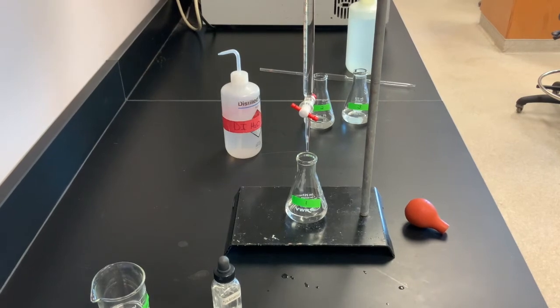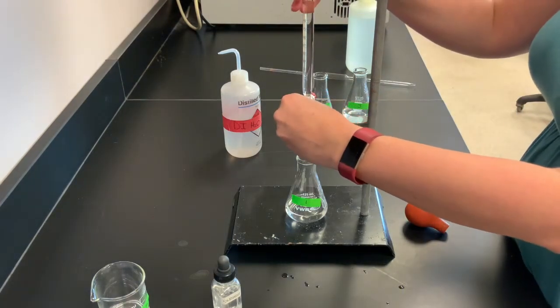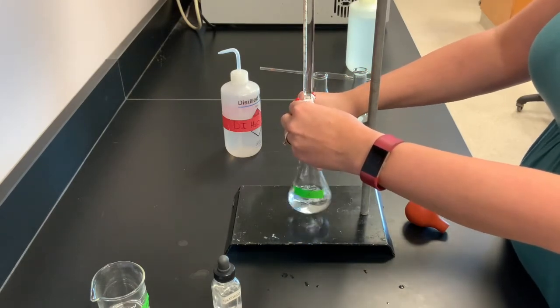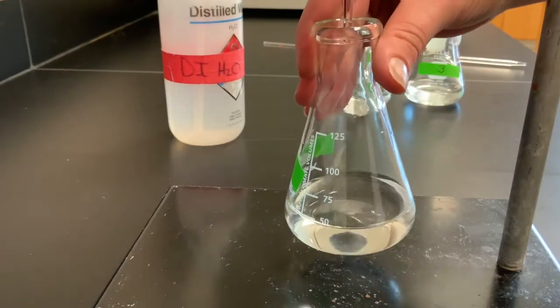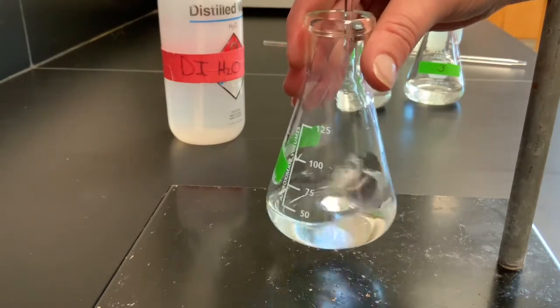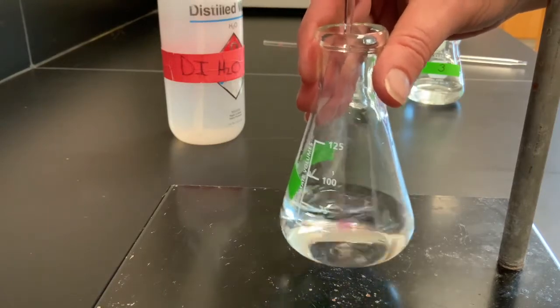So what we're gonna do now is start to slowly add our sodium hydroxide. We're gonna watch for that pink color to occur. Remember, we're looking for a pale pink color that's gonna last for at least 30 seconds.